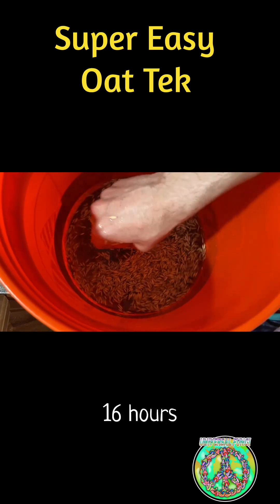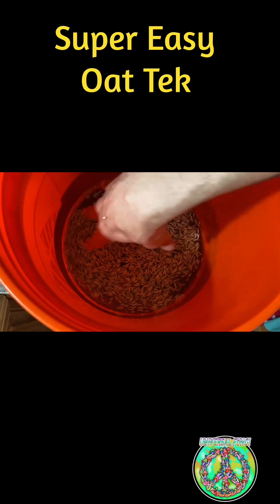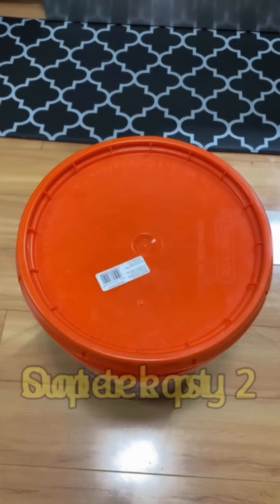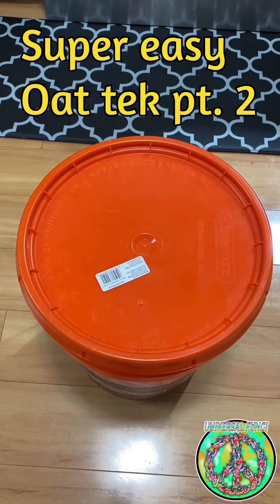After about 12 to 16 hours, we're going to come back and check them to see if they're ready. Hello universe, Universal Fungi here with part two of my simple grain prep tech. In the previous video, we measured out the desired grain and had it soak overnight. Today, we're going to check on the grains and get them ready for sterilization.